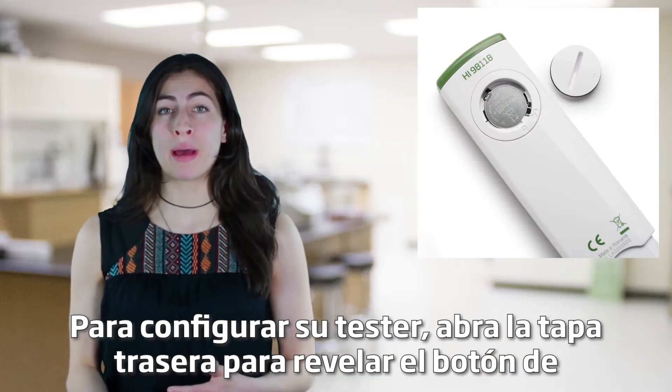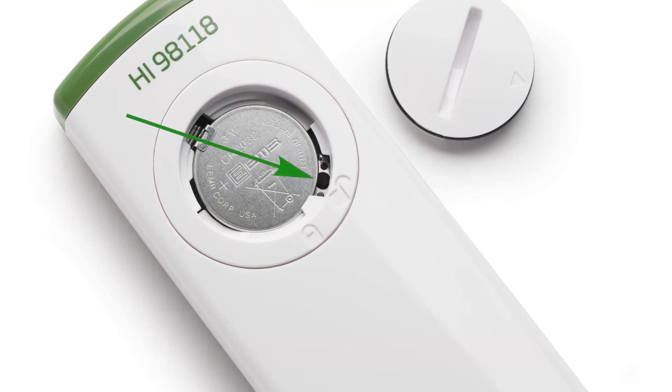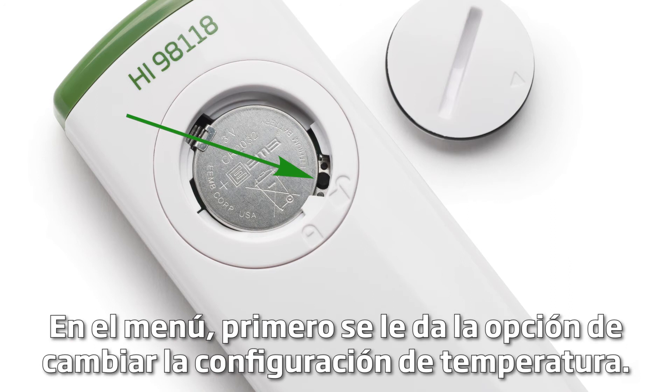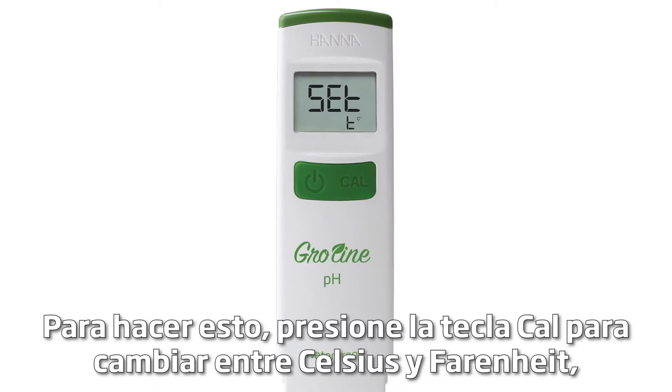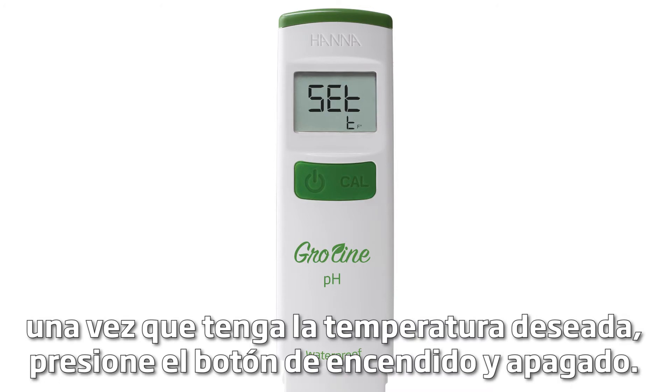To set up your tester, open the back cover to reveal the Setup button inside the battery compartment. Press the Setup Menu button. In the menu, you are first given the option to change your temperature settings. To do this, press the Cal key to switch between Celsius and Fahrenheit. Once you have your desired temperature setting, press the On-Off button.